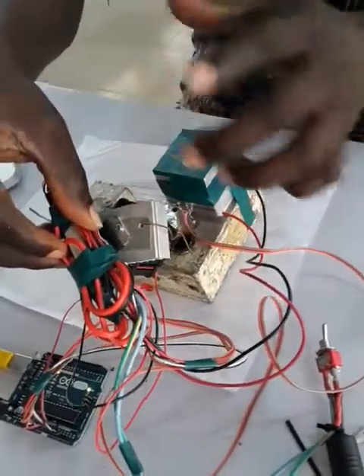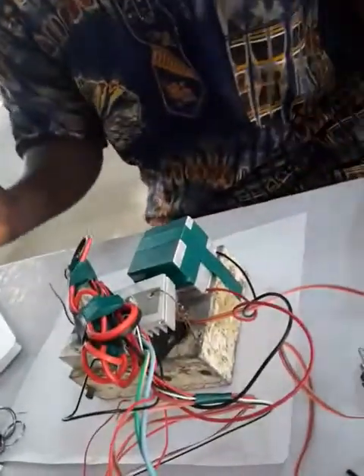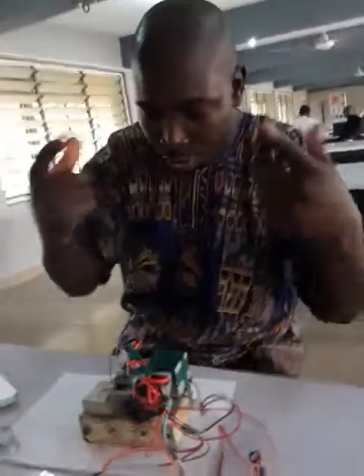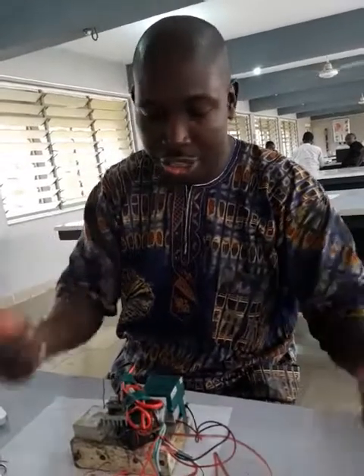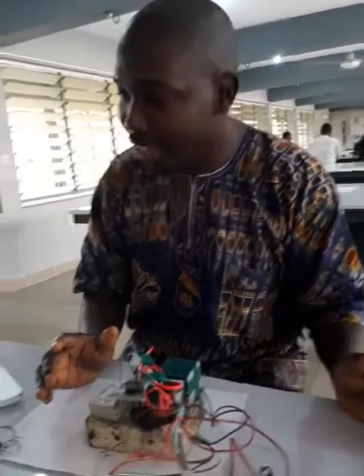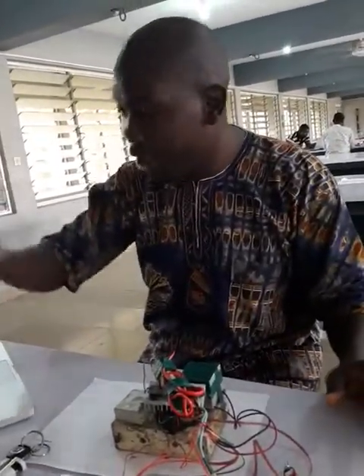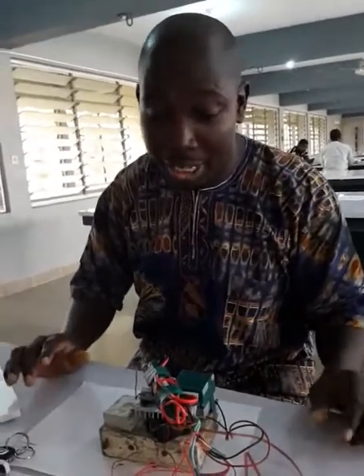And our fan — because this thing actually produces a lot of heat, so the big block is supposed to help us dissipate the extra heat. When we connect our Arduino, we have different cycles the PCR can run for a specific number of cycles, great loops. With that, we are actually making the normal conventional PCR machine in at least a simple fashion. We're going to use the serial monitor on the Arduino software to show the changes in temperature.